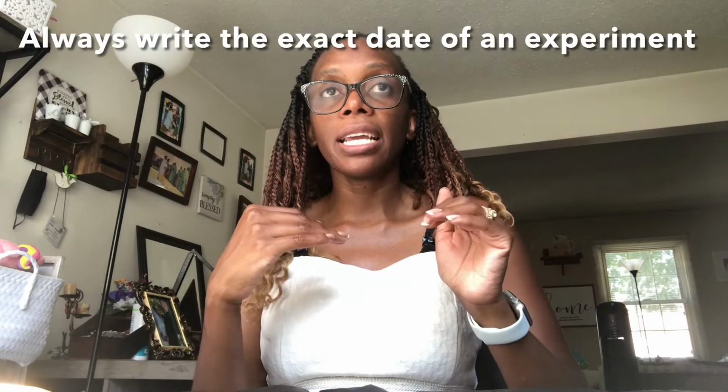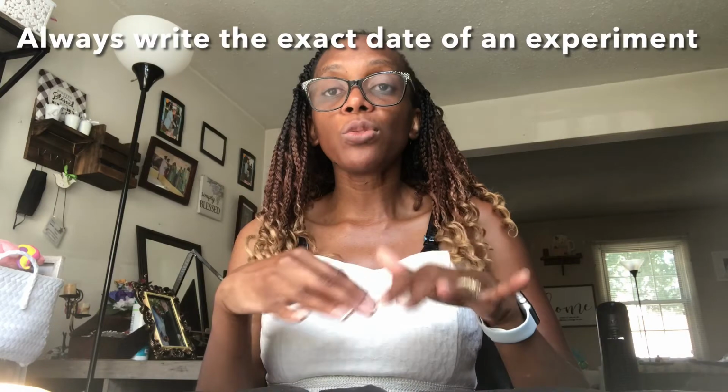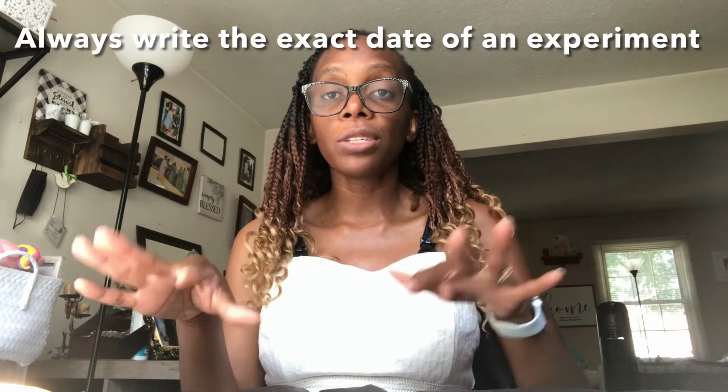This video is going to be a shorter version of what we did yesterday, because you have an idea of what that is, but just so that you can refer to this as you continue doing the experiment for the other locations. And always remember that you might do experiments for each location on different days.